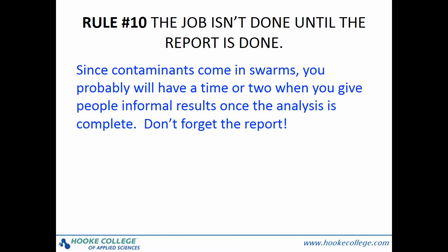Rule number 10: The job isn't done till the report is done. Don't forget the report. That's one reason I like a combined sample submission and report form, and documenting as you go along. It's not much of an extra step to add the results to the form once you are done.